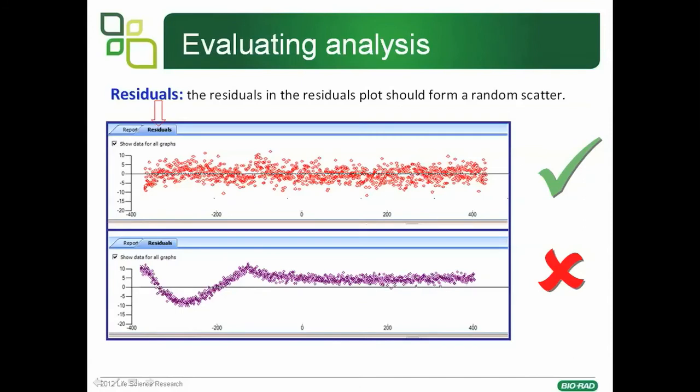Another way of examining the fit is to look at the residuals. If you click on the residuals tab next to the plot, you should see that the residuals are randomly scattered around zero, as in the red dots — there is no trend, just representative of random noise. As opposed to the lower plot, where you can see that there is a pattern to the residuals, with parts where the model underestimates and parts where the model overestimates the rate constants.